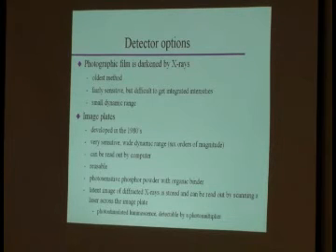So, that's how you mount your sample. Never thought there was so much to doing a diffraction experiment, did you? Let's talk about the last part of it, detector options.